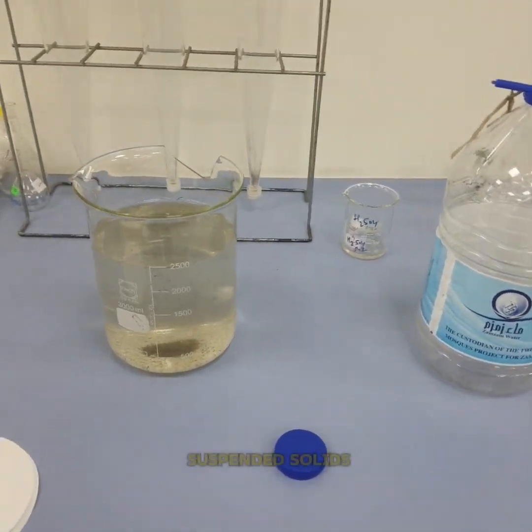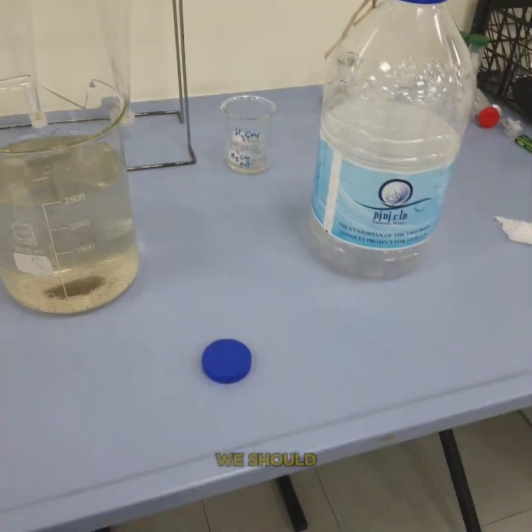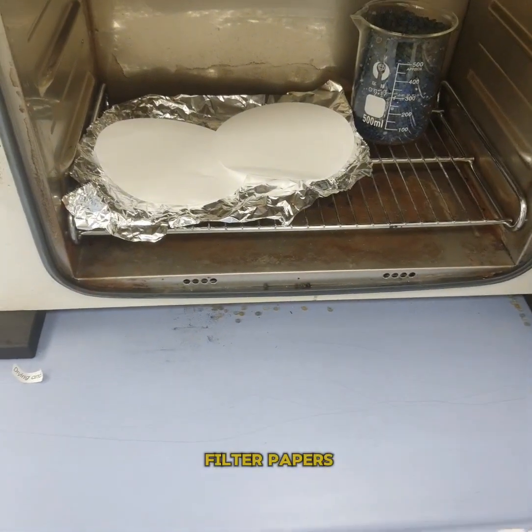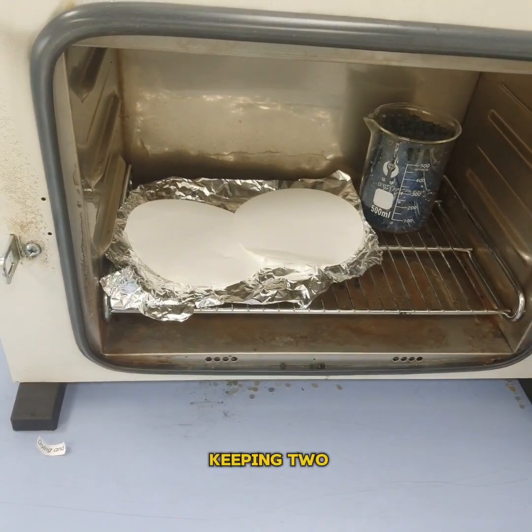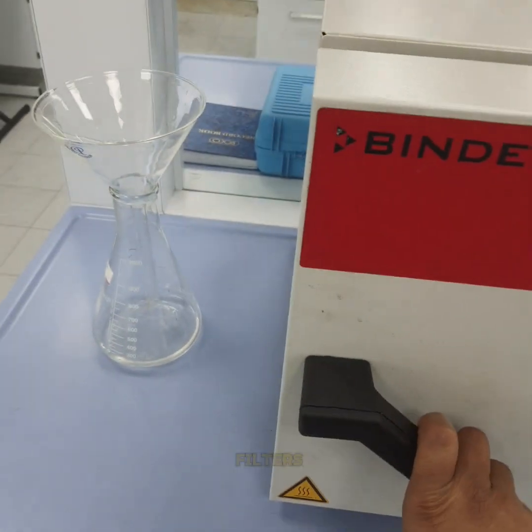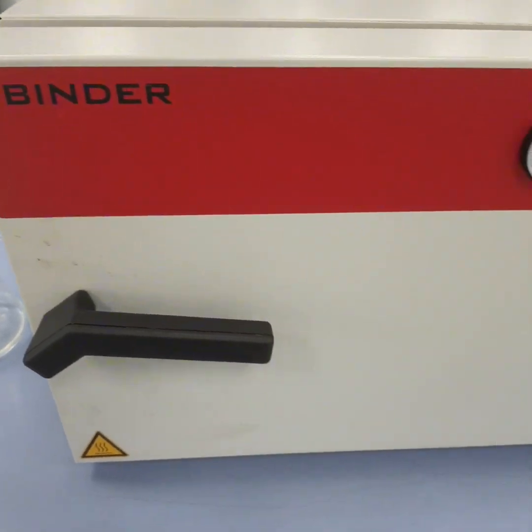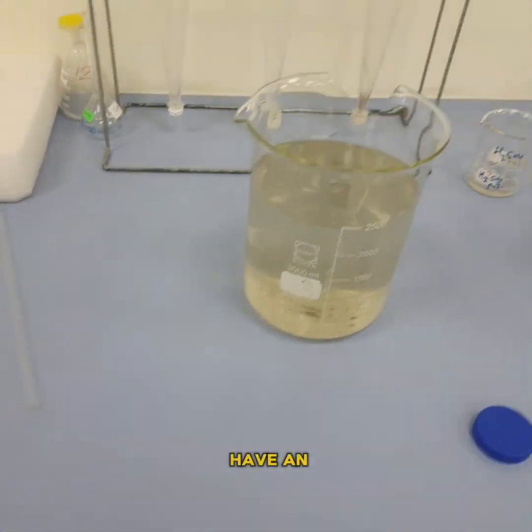Now these are our filter papers. First of all, for carrying out the mixed liquor suspended solids or total suspended solids, we should dry these filter papers. I have added two filter papers so that I'll be having two samples in order to minimize the error. Let us dry these filters at around 100 degrees Celsius for half an hour so that the moisture in the filter is removed.